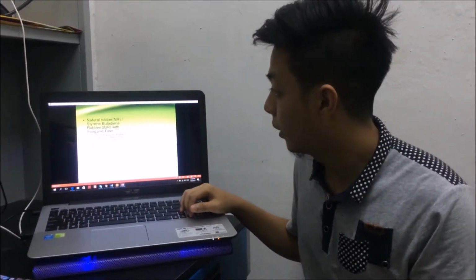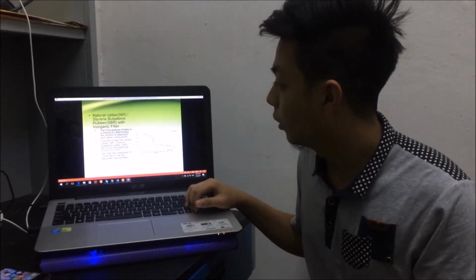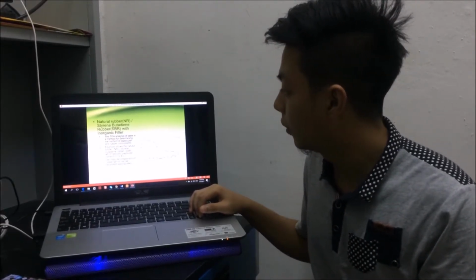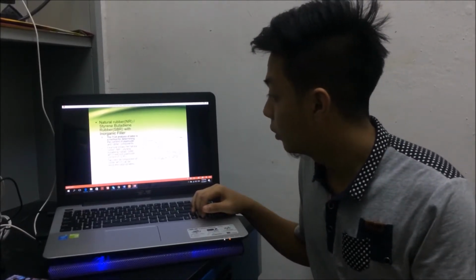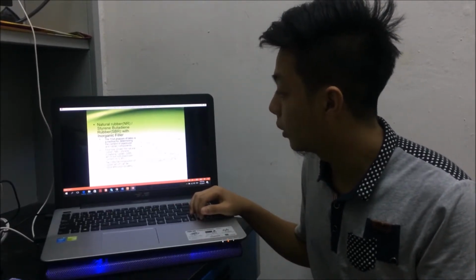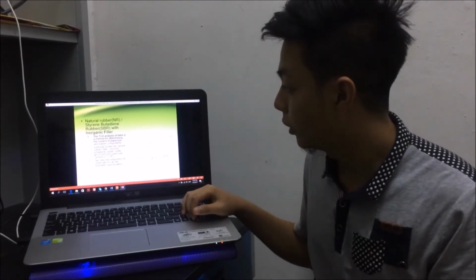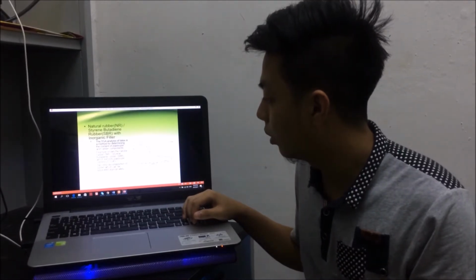Natural rubber NR, styrene butadiene rubber with inorganic filler. The TGA analysis of rubber is a method for determining the content of plasticizer and rubber component. The example shows the natural rubber NR and or SBR, which exhibit a plasticizer content of 12.4%. A two-step composition of rubber which can be separated appropriately.